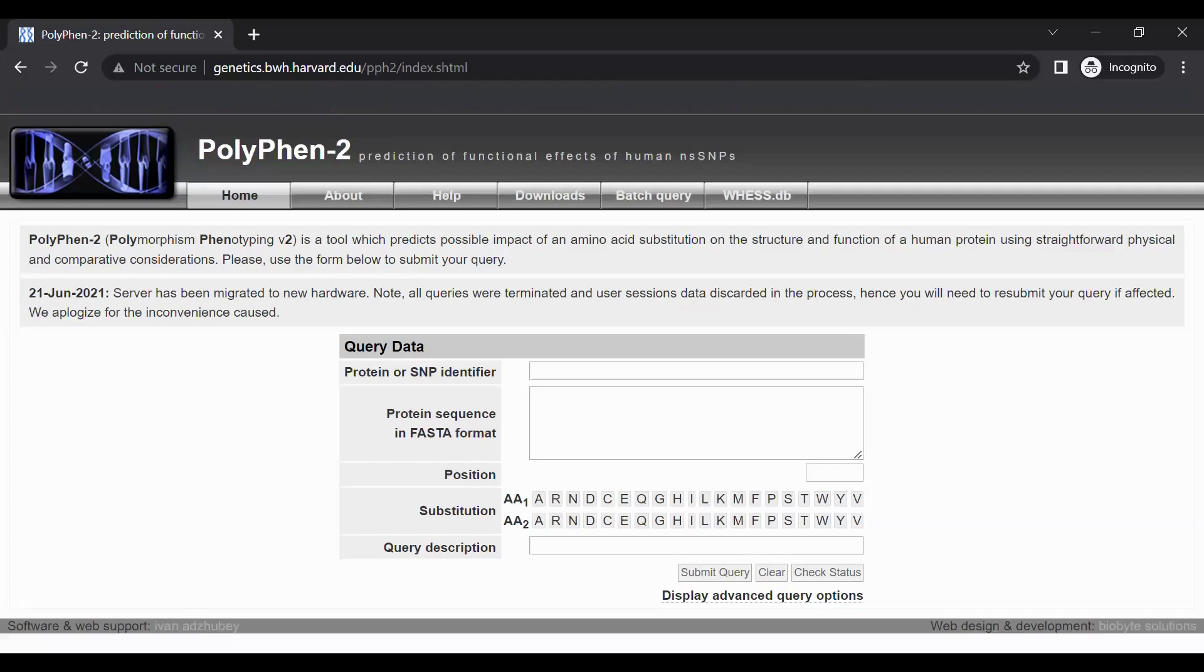To begin, locate the submission form labeled Query Data on the home page of PolyPhen-2. Then, locate the text box labeled Protein or SNP Identifier.